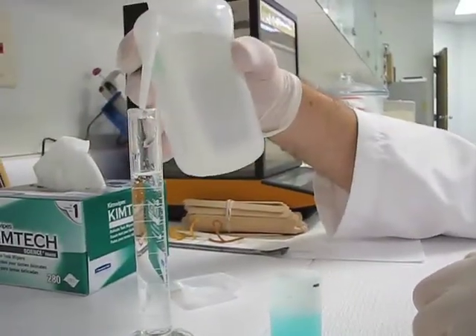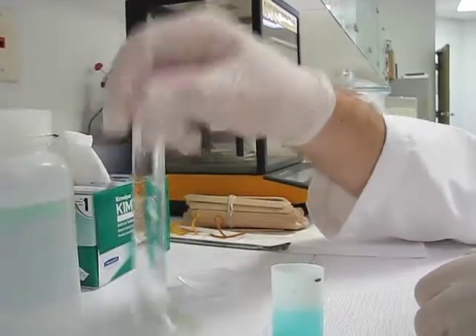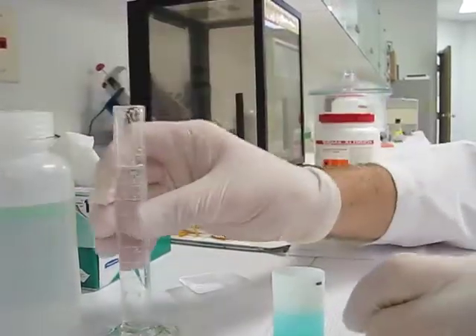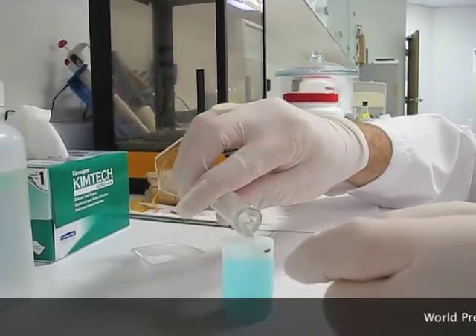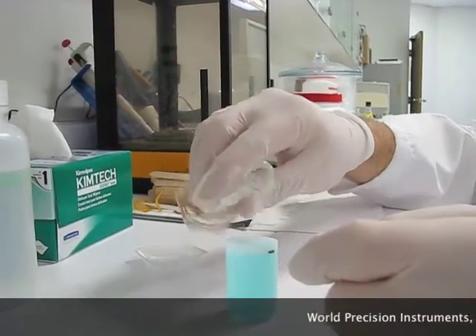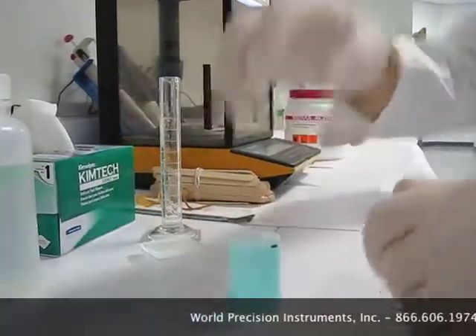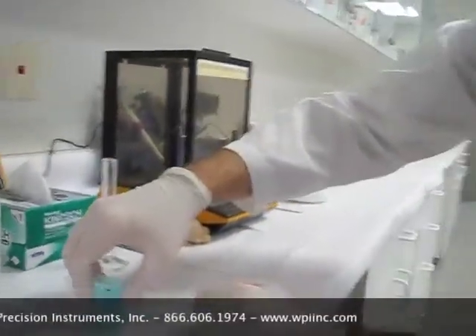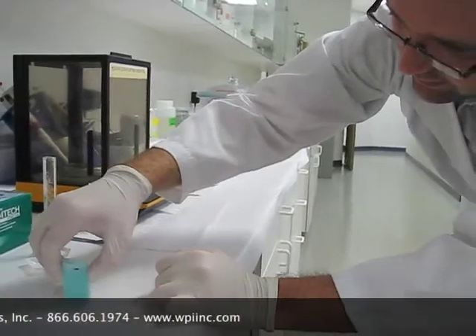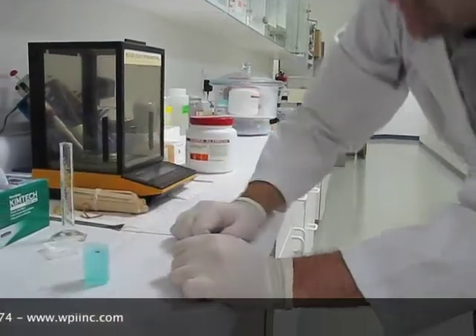I'll push that off right there. Now we have 20 milliliters of 0.1 molar copper chloride. This can be used to calibrate any of our nitric oxide micro-sensors.